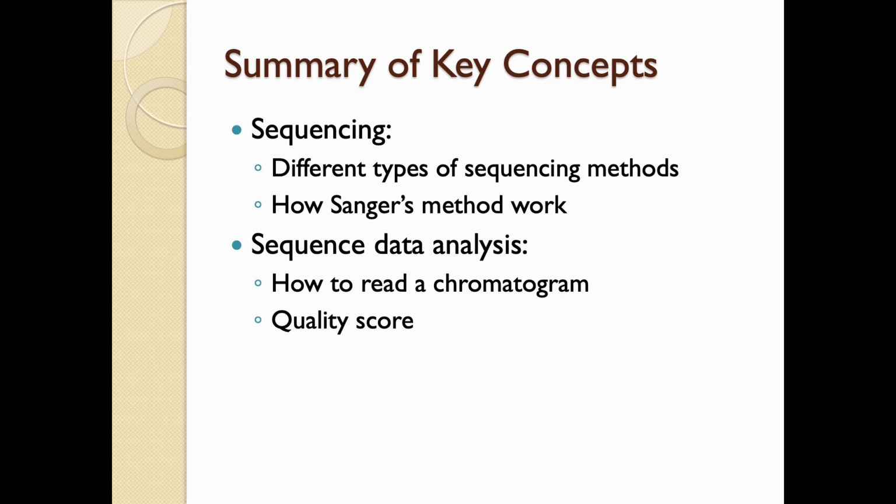We also discussed quality scores, especially the Phred score, which tells us how confident we can be in each base call. A score of 20 means 99% accuracy, while a score of 30 means 99.9% accuracy. These scores help us to decide which parts of the sequences are reliable enough for downstream analysis. Finally, we emphasized the importance of not relying solely on FASTA files. Automated base callers can miss subtle peaks, so always inspect the chromatograms to ensure your data is clean and accurate.